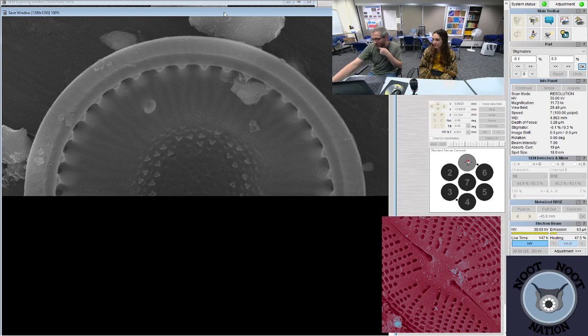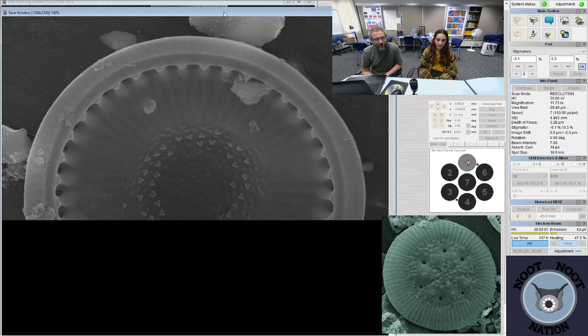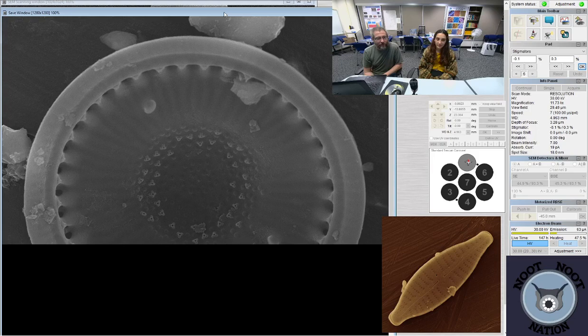They only use silica. Diatoms are silica-based organisms. Their cell walls are impregnated with silica, always. There are some that are very lightly silicified, but it's still silica. It's a requirement for a diatom, to be classified as a diatom.